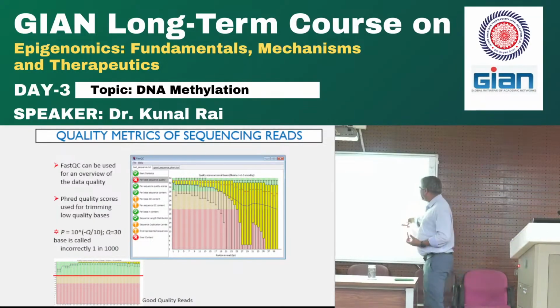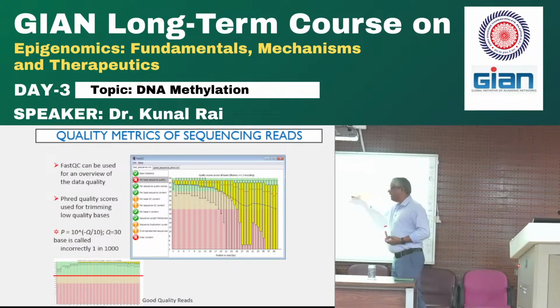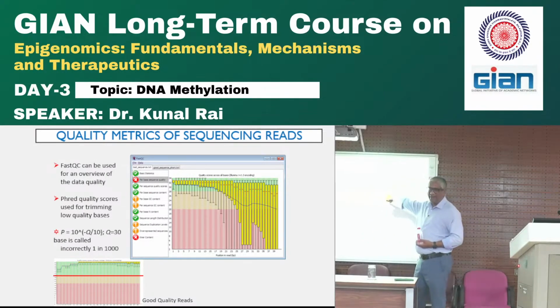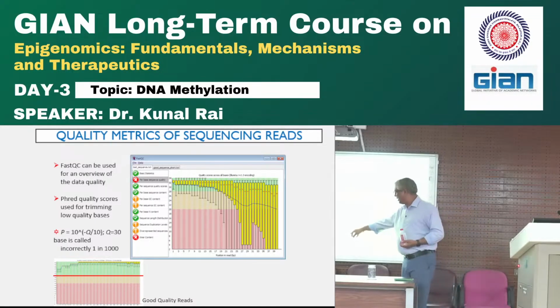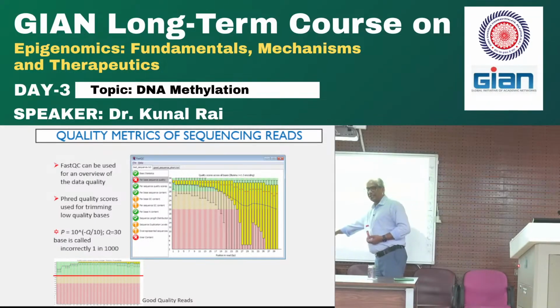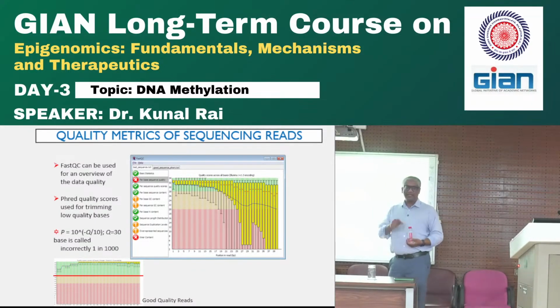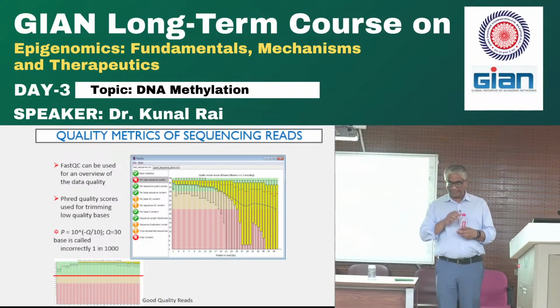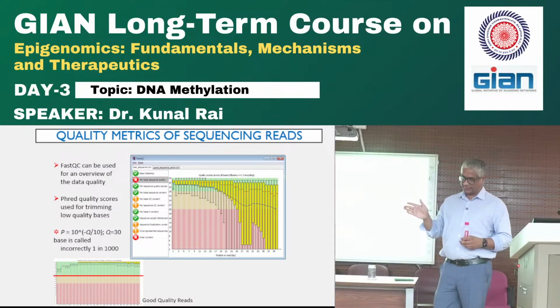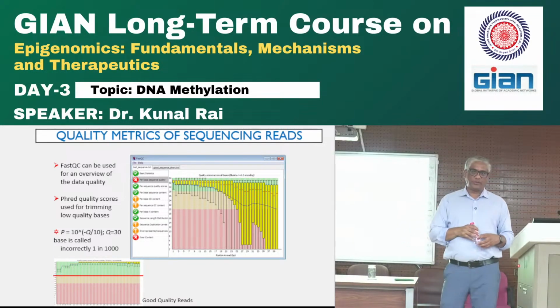This looks like this. This per base sequence quality has a big red mark next to it. Means the sequencing failed. Okay. Whereas in the bottom here, this sequencing is a good quality sequencing, you see? Per base quality, meaning how confident are you that the sequencer did not make a mistake when sequencing that base, is what this QC matrix is, okay?